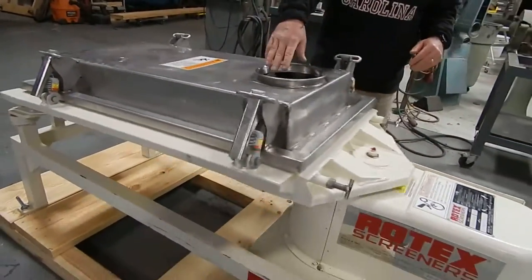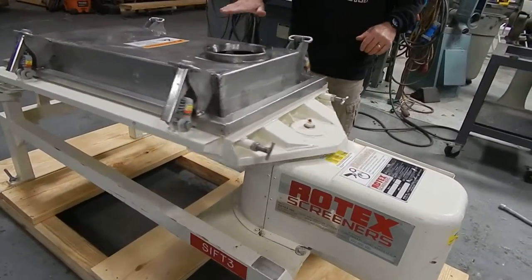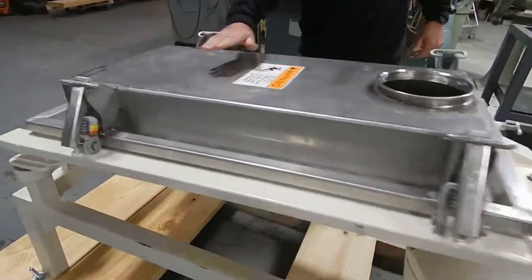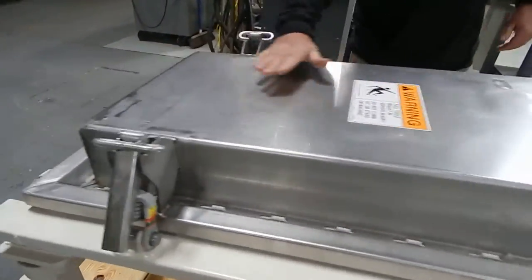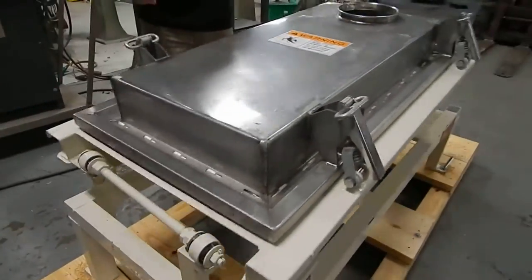So as material enters the sifter, there's a small baffle plate in here that directs material to both sides. You get this kind of left-right circular elliptical movement, and then as it reaches the base here, you see it's more of an up-and-down movement. It kind of helps assist discharge a little more efficiently and a little faster.